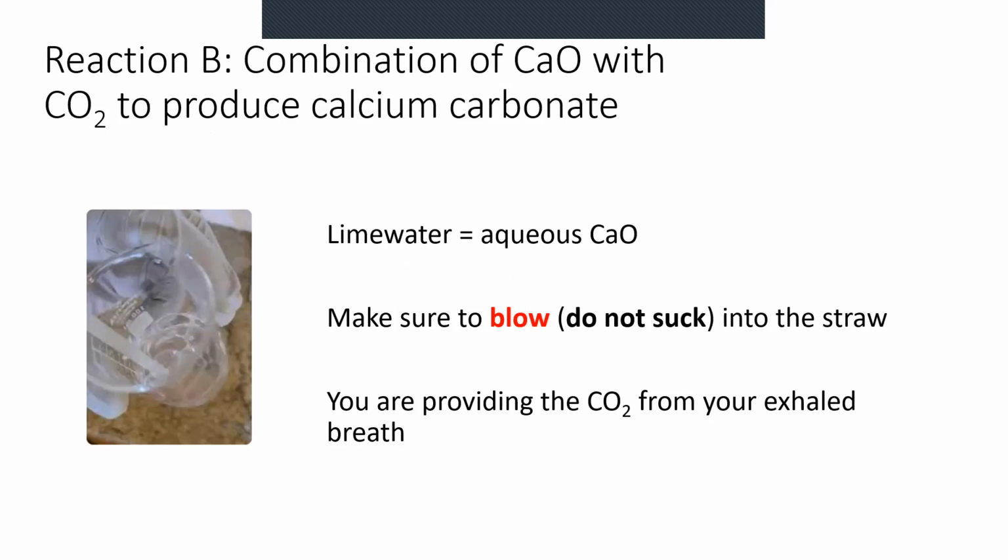Reaction B is the combination of calcium oxide, which is also known as lime water, with carbon dioxide to produce calcium carbonate. So in this case, we're going to take lime water, and you're going to use a straw to blow into the liquid. Be careful to blow into the liquid and not suck the liquid into your mouth. That's an important safety precaution that you want to pay attention to.